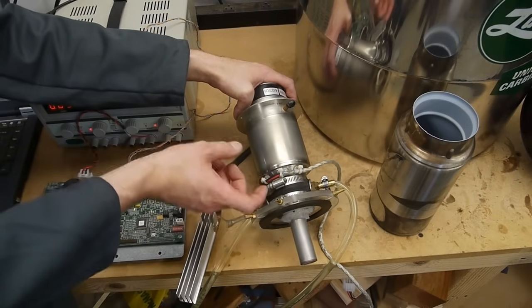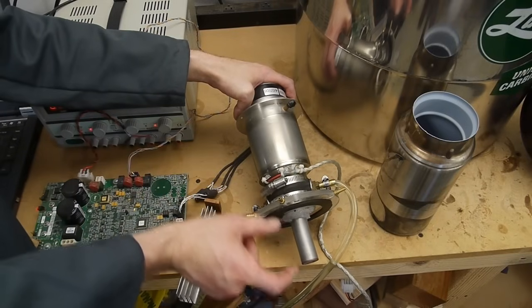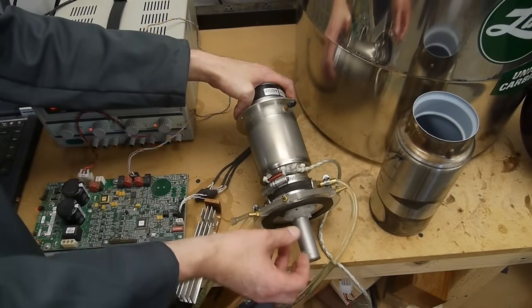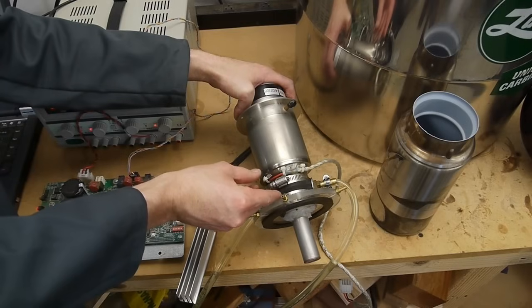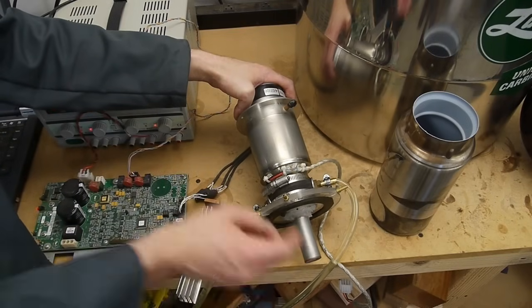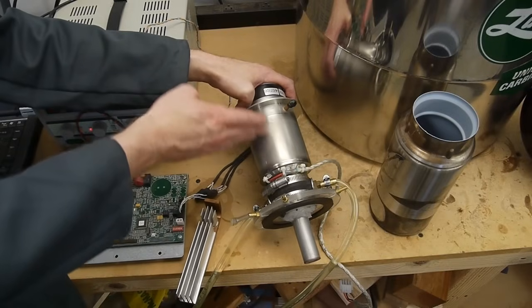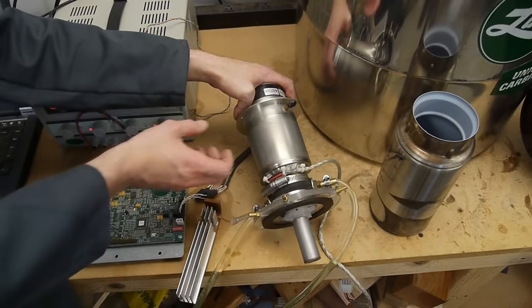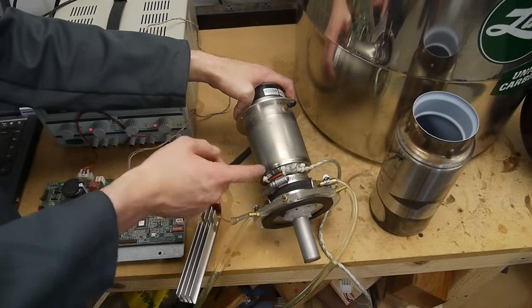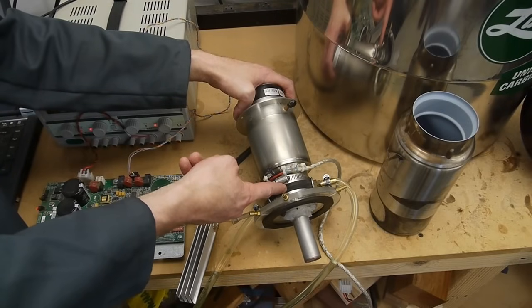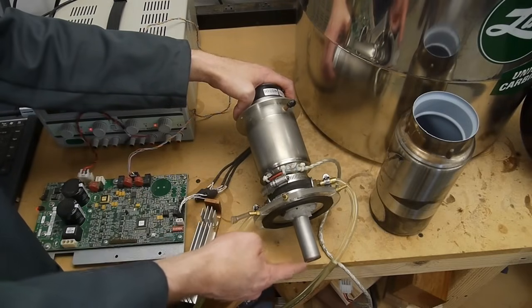It's called Sterling cycle because it has two pistons inside here. One piston moves the gas back and forth, the displacer. When the displacer is down at the tip there's very little gas here it's all contained here and when the displacer moves back up the gas is forced back to here. Then there's another piston up here which is driven by these coils, it's basically a linear motor, and when that piston moves it changes the pressure. It's being compressed here and expanded here so we get heat pumped.